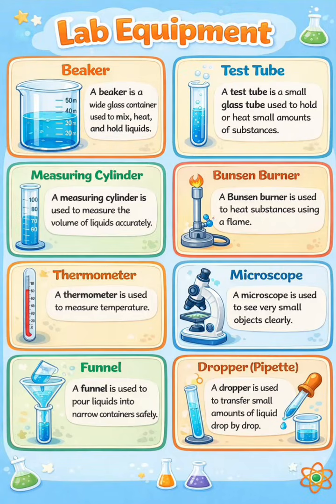We'll be learning about lab equipment. Here we see beaker, test tube, measuring cylinder, and so on, as you see on the list. First, a beaker. A beaker is a wide glass container used to mix, heat, and hold liquids.